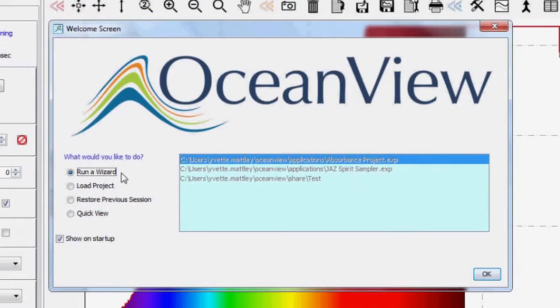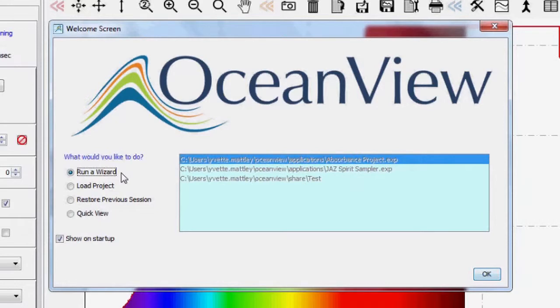Choose the Run a Wizard option to launch a wizard that will walk you through the steps necessary to optimize the settings and get into process modes like absorbance, reflection, transmission, and many others.